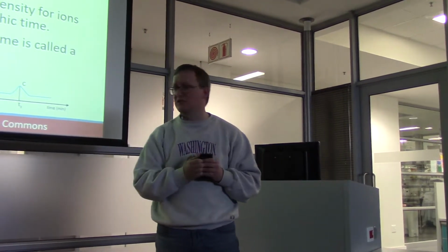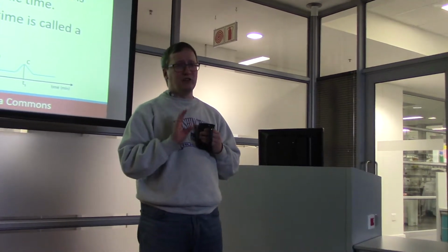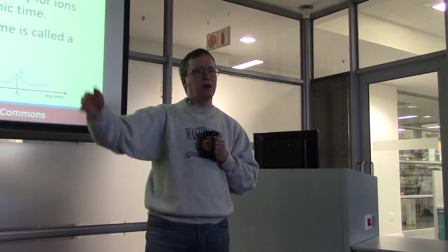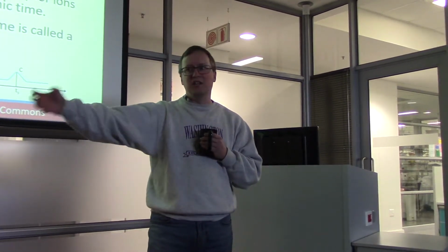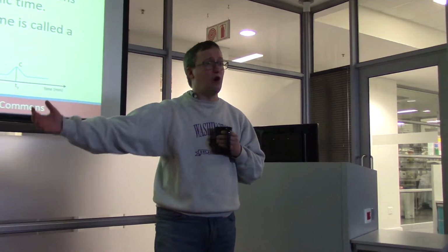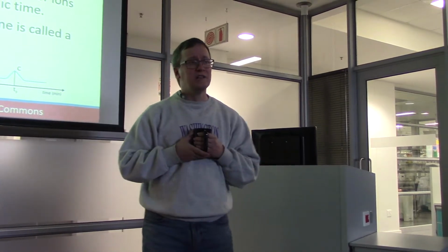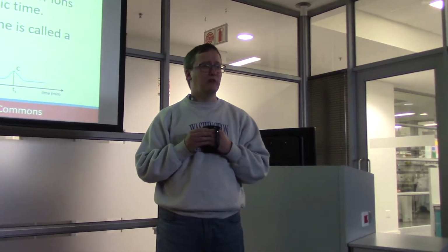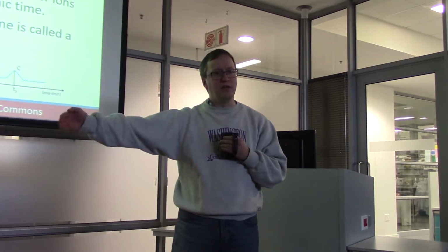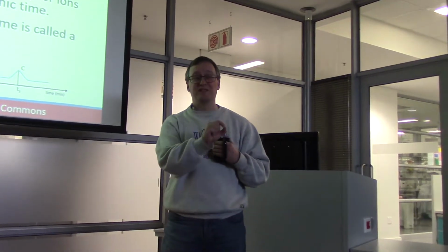That's our time axis. Now, we could be talking about a total ion chromatogram, which is to ask how much electrical signal are we producing in the ions we can detect as a function of time. This is a combination of all the different peptides that are being detected at any one point in time. So a TIC, a total ion chromatogram, is just a way to say how much signal is reaching the mass spec as a function of time in an RPLC experiment. I'm being a lot more specific here though.